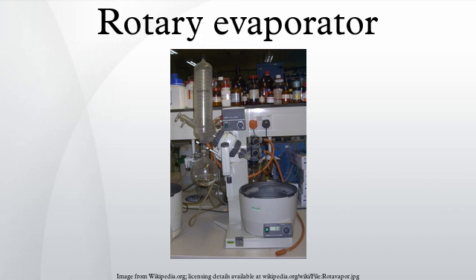commercial chemical operations. Design: the main components of a rotary evaporator are a motor unit that rotates the evaporation flask or vial containing the user's sample; a vapor duct that is the axis for sample rotation, and is a vacuum-tight conduit for the vapor being drawn off the sample; a vacuum system, to substantially reduce the pressure within the evaporator system; a heated fluid bath to heat the sample; a condenser with either a coil passing coolant, or a cold finger into which coolant mixtures such as dry ice and acetone are placed; a condensate collecting flask at the bottom of the condenser, to catch the distilling solvent after it recondenses; and a mechanical or motorized mechanism to quickly lift the evaporation flask from the heating bath.